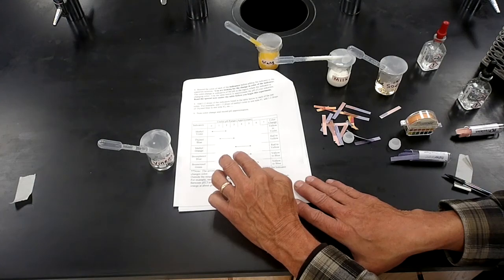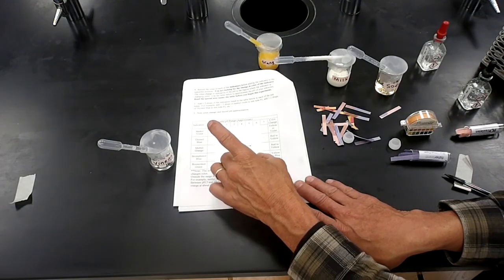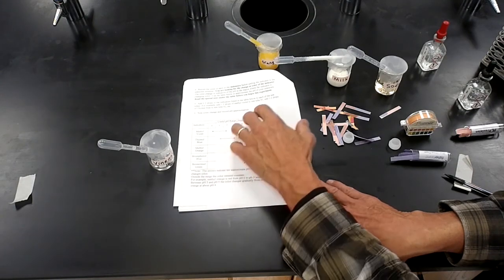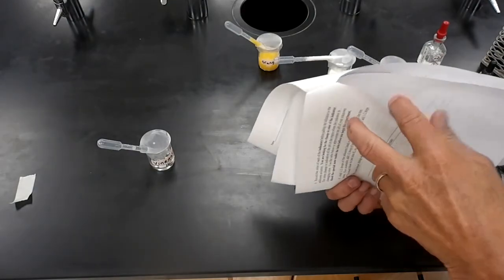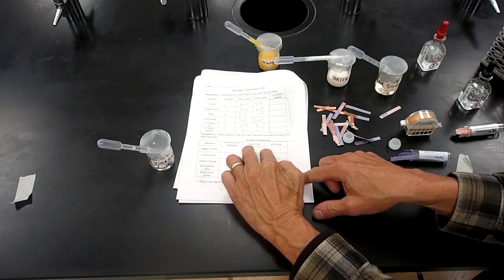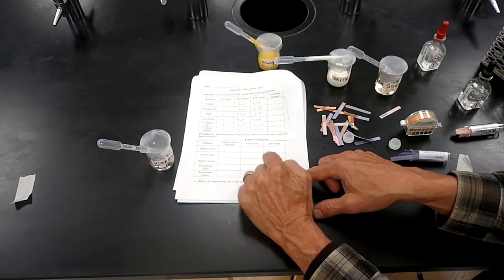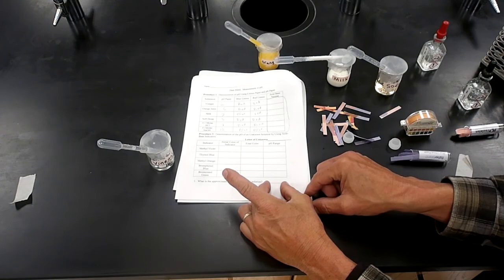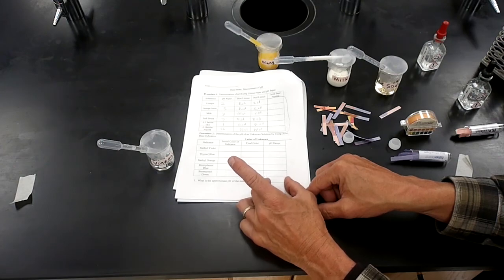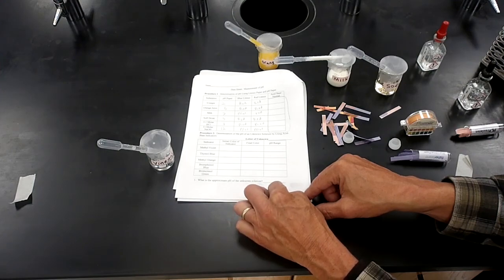So what I'm going to do is take an unknown solution and use these pH indicators, and that should allow me to narrow in on approximately where the pH is. That's what you'll be doing. I'm going to give you the color I get for these. The initial color is not very critical, but I'll fill out the final color, and then from that color you'll pick out the pH range for each dye. It should allow you to narrow down within a pH unit, so it's not that close. But if the pH is 2, you should be around 1, 2, or 3. You'll get that close, and you'll be able to determine, which is what you'll be answering, the final pH of the unknown solution.